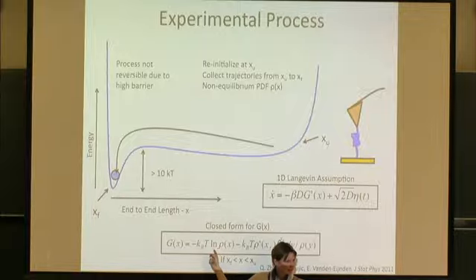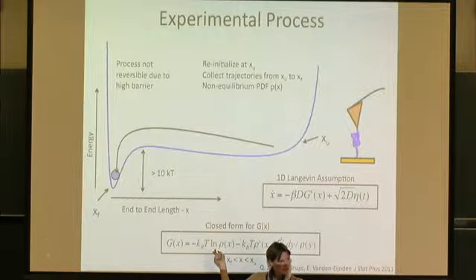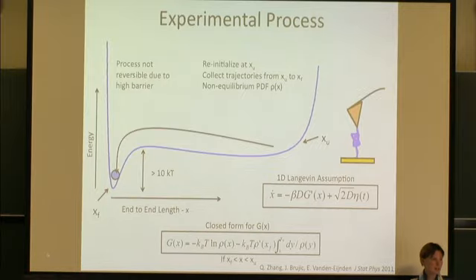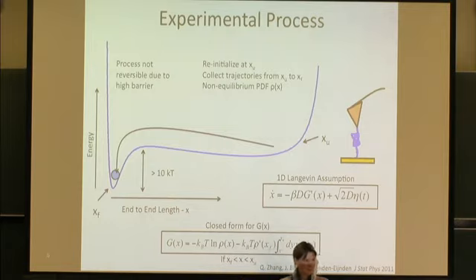That's non-parameterized. But then at the end of the talk, you wrote down an expression for the free energy that had some particular functional form. Oh, okay, I see what connection you mean. Here it's just in terms of the end-to-end length. In the other case, it's to relate the end-to-end length to this collapsing model and having information about the origin of the shape of the G of x in terms of the size of the blob, the persistence length of the chain, the contour length of the chain.